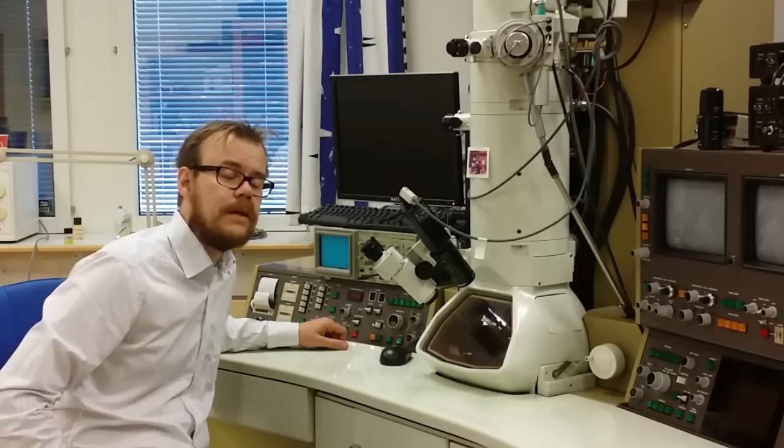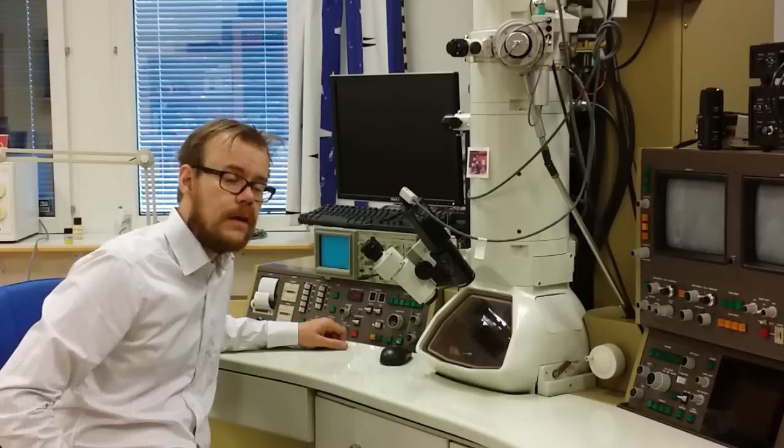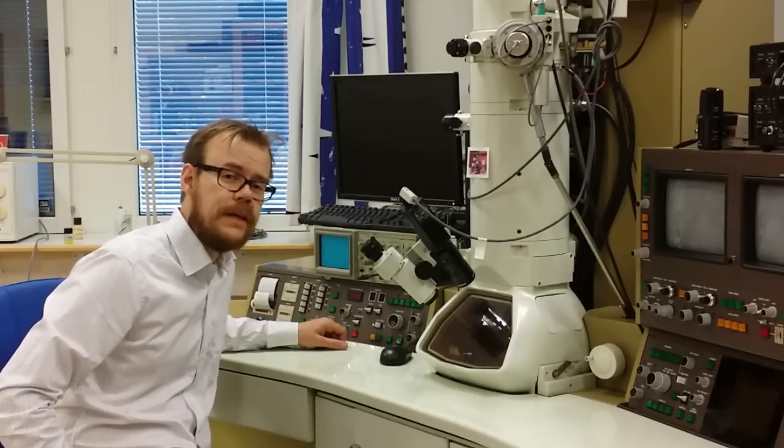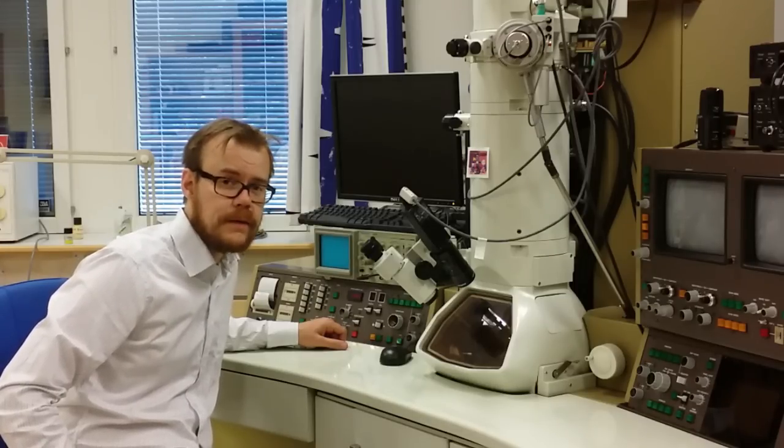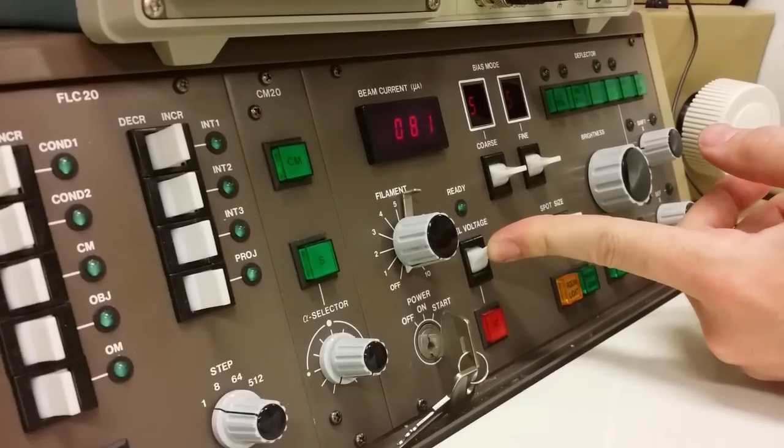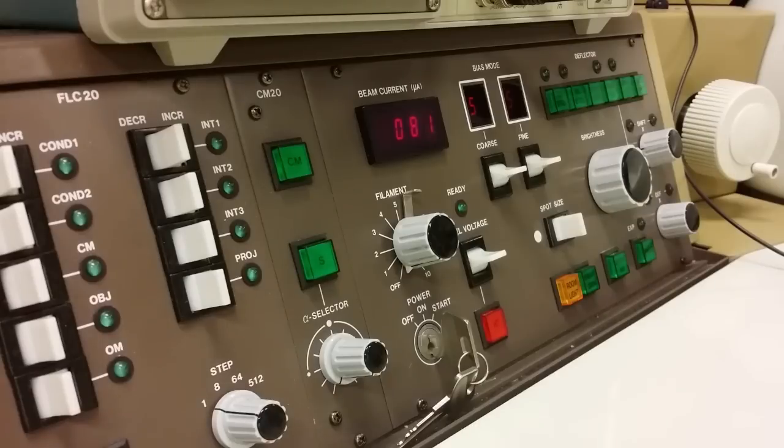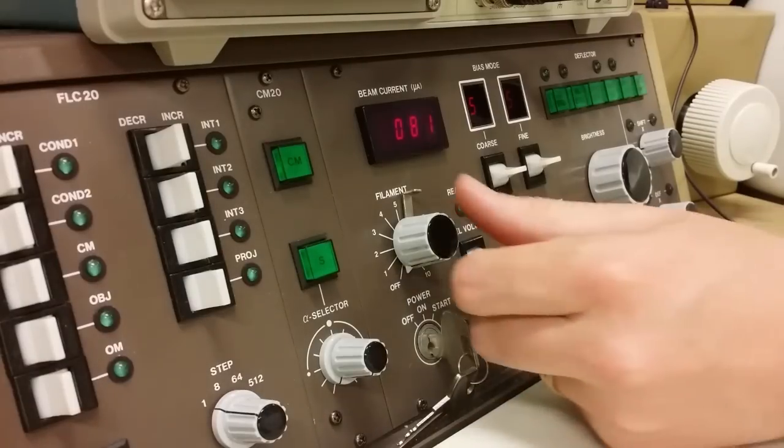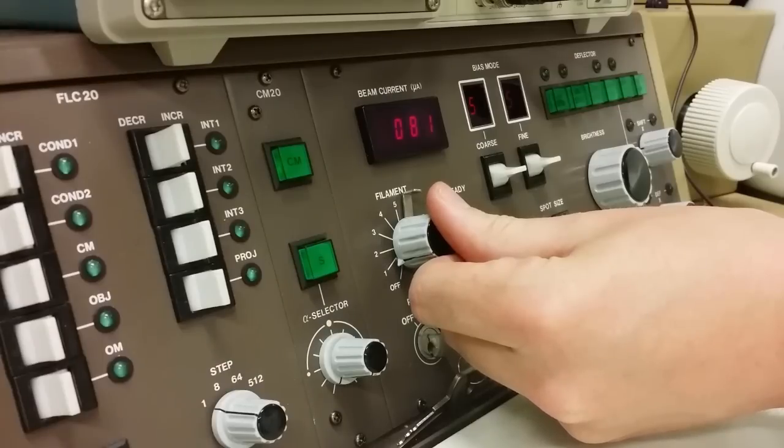The second step is to increase the accelerating voltage. And we do that in steps of 10kV. And we continue that until we reach the settings of voltage that we require for the experiment. Now I have reached 160kV. And I can see that the beam current here shows 81. And that is okay.